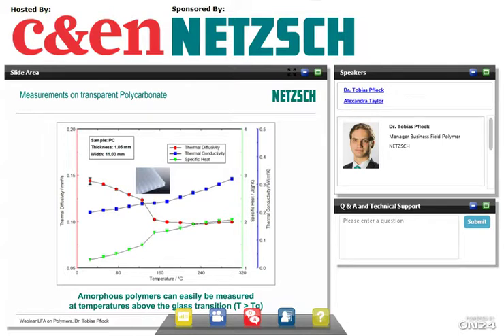If a polymer moves during these tests, will you get the same result? Actually, it should not. It depends on what moves. If you just give the device a neat push, as it changes the boundary conditions, it will also change the response that you get on your detector. But it depends on how much your sample actually moved.